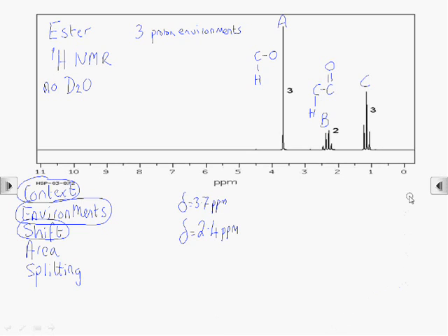And finally, peak C. That's a hydrogen connected to a carbon that's part of an alkyl group.